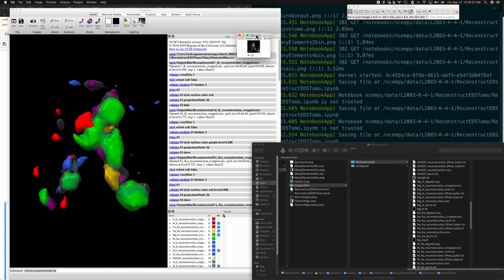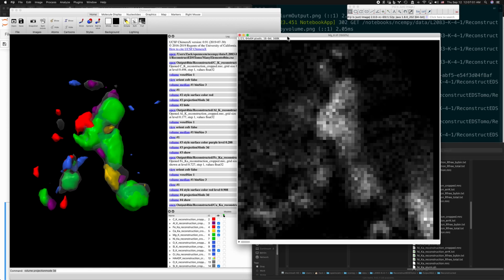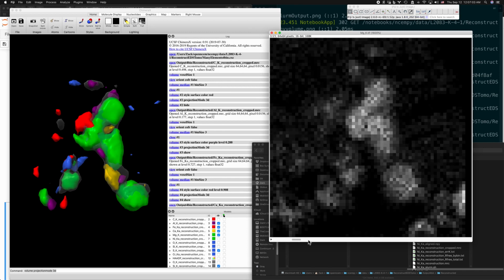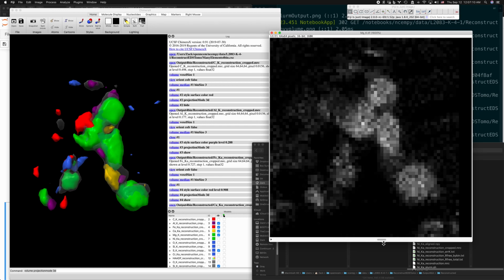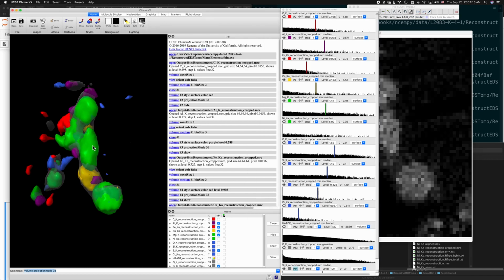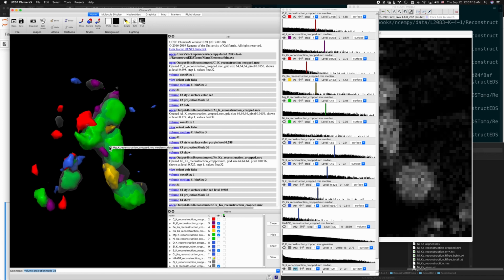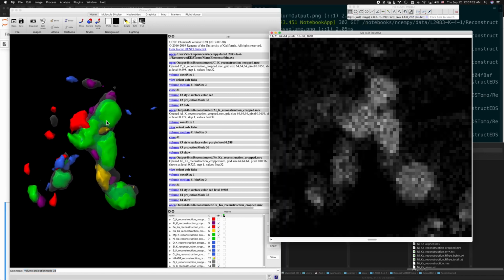So this is the magnesium K stack. And somewhere around the middle is the 0 tilt. So you have to look at the actual number. So this is 0 tilt right here. And if I rotate this around to 0 tilt, then I should be able to see these same outlines for the magnesium features.